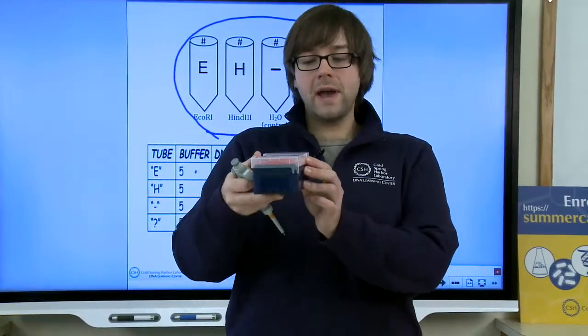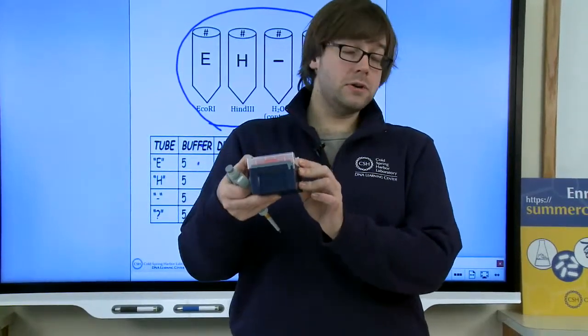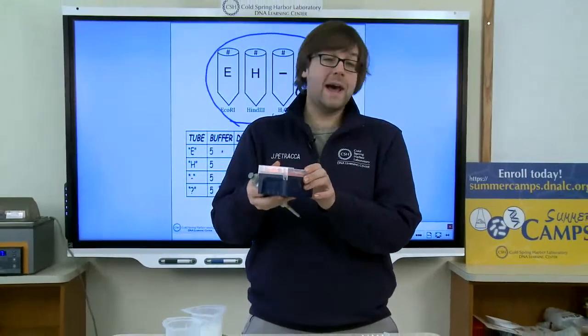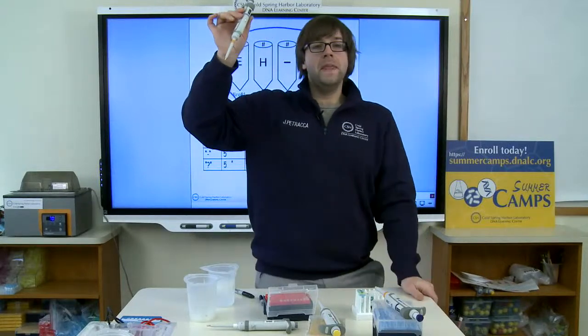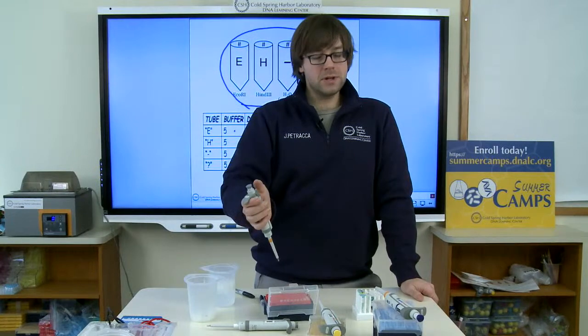So whenever you're working with pipettes, you want to make sure that your box of tips is closed when they're not in use. You don't want to ruin future experiments by accident. Okay, so I'm going to open my box of tips here, and then I'm going to take my pipette and very carefully press it into one of the tips. It doesn't take much force to get it on there.